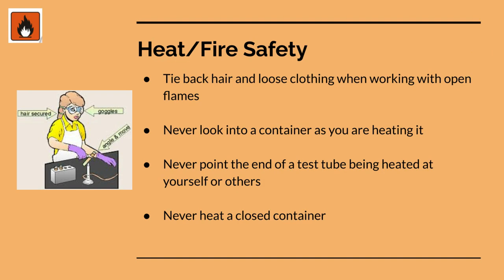Okay, heat, fire safety. Already kind of touched on these. Tie back any loose hair, loose clothing when working with open flames. Never look into a container as you are heating it, because some chemicals get pretty volatile when they're heated up, and it will splash you in the face. As a good example, if you've ever had to heat up enchilada sauce or tomato paste, you'll know exactly what I'm talking about. That stuff bubbles. If you don't believe me, go home, grab some Prego, heat it up moderately, and you'll notice there's a lot of tomato sauce that splashes everywhere.